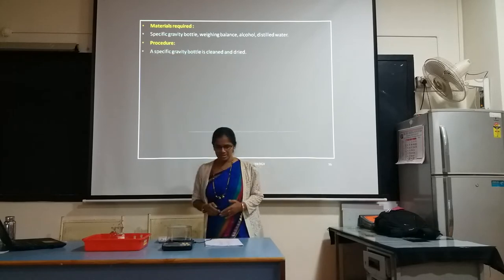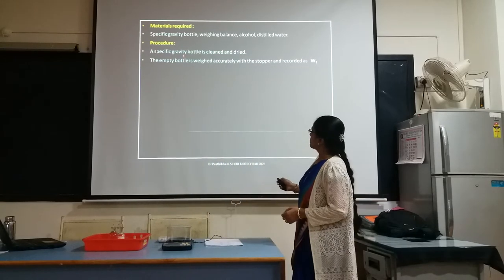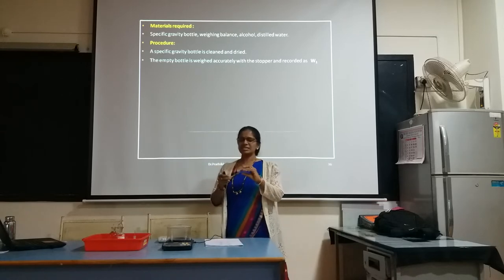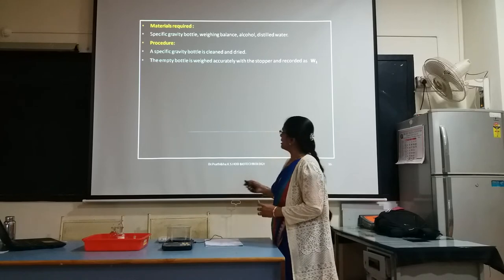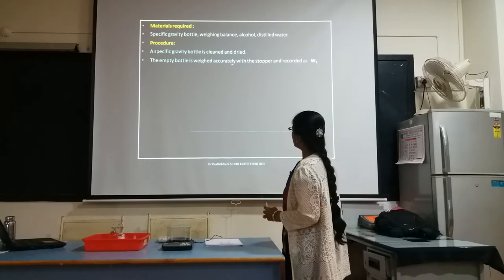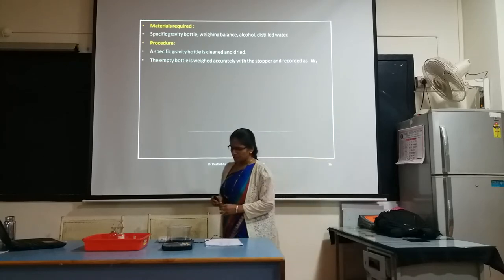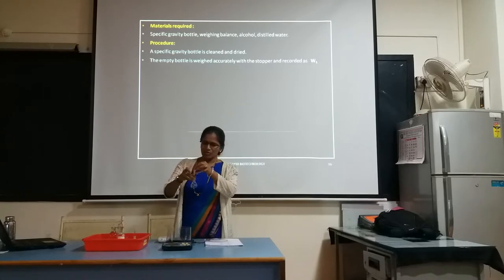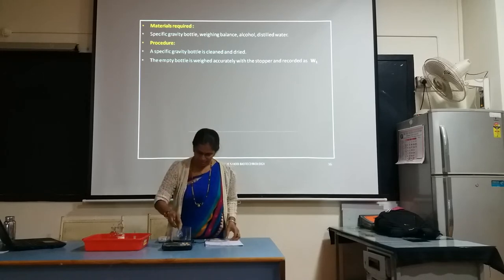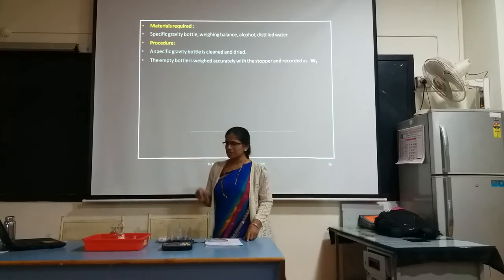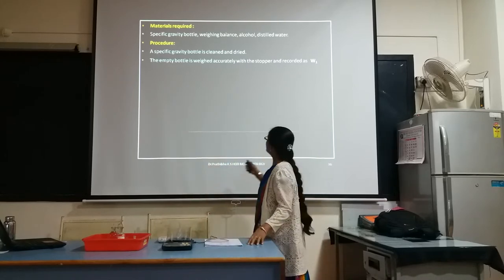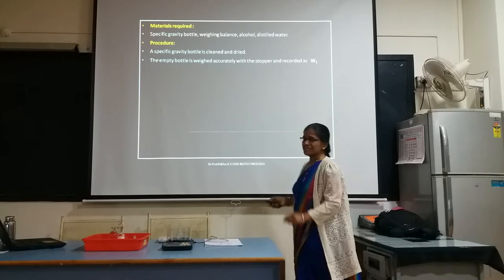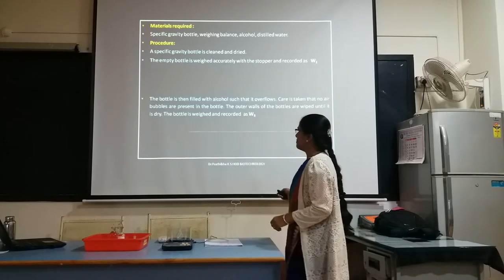Now let us go through the procedure step by step. First step: a specific gravity bottle is cleaned and dried. You need to take the specific gravity bottle, clean it carefully, and dry it using an air dryer or hand dryer. The empty bottle is weighed accurately with the stopper and recorded as W1. So this is your specific gravity bottle — you need to weigh this empty specific gravity bottle along with the stopper and record that weight as W1.